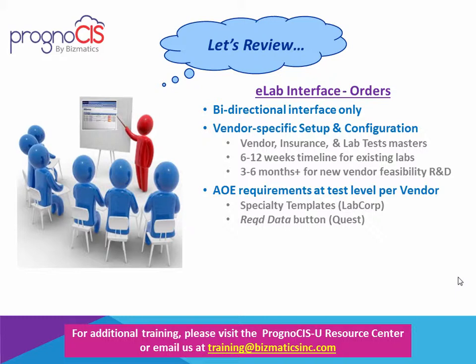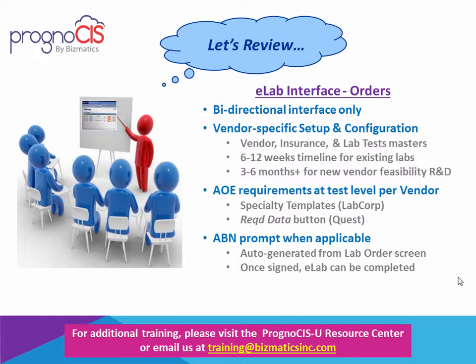Some vendors have ask on order entry requirements based at the specific test level. This is handled, for instance, for LabCorp by means of specialty templates where you can enter the additional data required for the applicable tests. And with Quest, we provide a pop-up button called Required Data right in the middle of ordering the test. When an ABN or an advanced beneficiary notice is applicable based on the test and ICD combination, you will be able to auto-generate it directly from the lab order screen, and then once it has been signed by the patient, it will be included with the eLab order once you transmit it successfully.